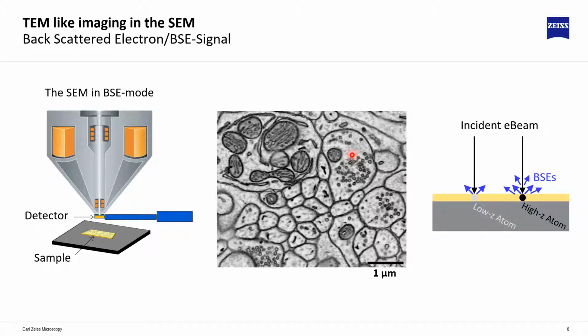And suddenly this actually looks like a cross-section image from a TEM, very similar, right? So here's a cloud of neurotransmitter vesicles. We see mitochondria with the inner membranes, and down here that might be the beginning of a synapse. If it had a possibility to move in the third dimension, we might see that there's the chemical synapse eventually emerging.